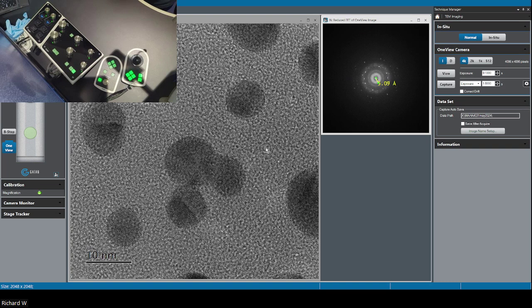So that can be used for the alignment. Failing that, you might have a glue line from a mechanically polished sample, or on a FIB sample at the very base, it's possible that there could be redeposited material from the FIB, so damaged material, and that might be amorphous.